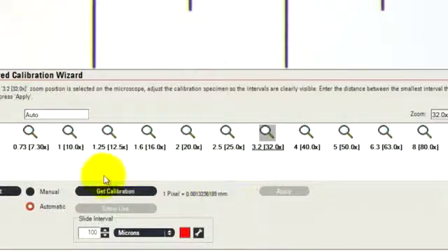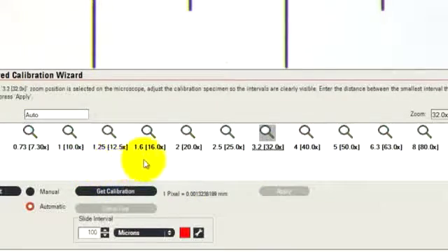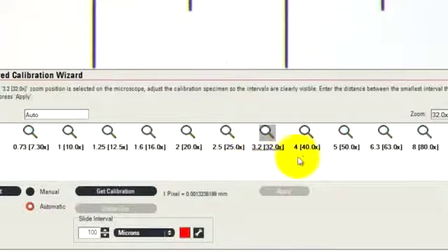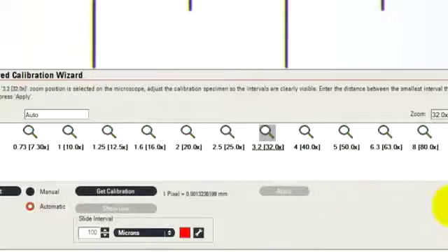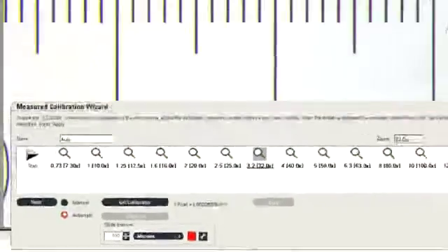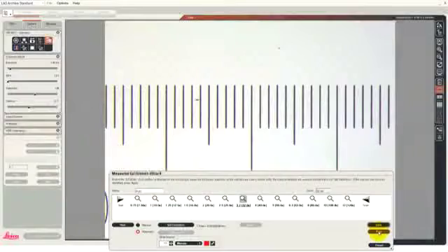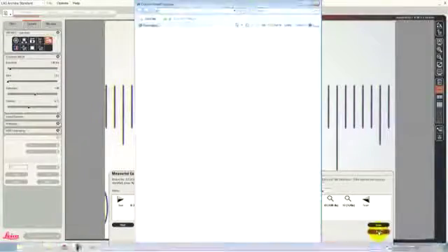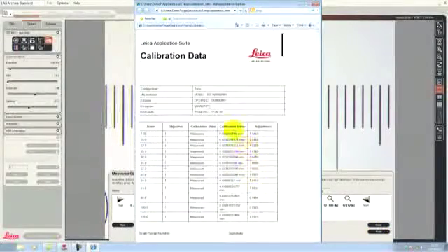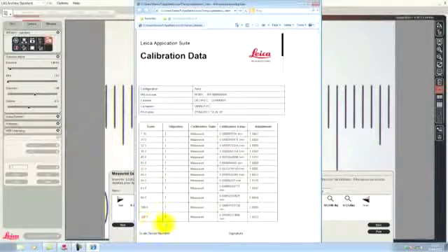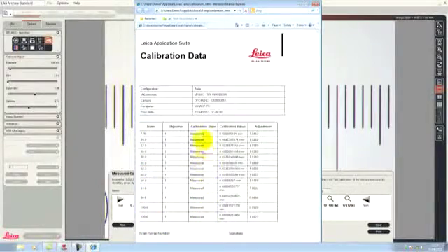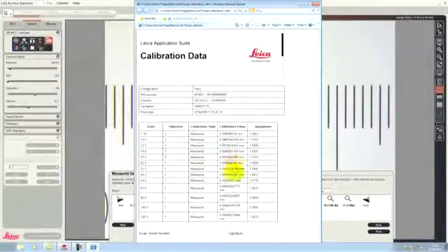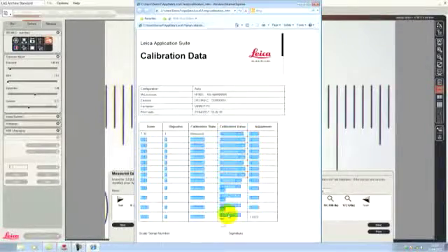In this particular case, I would normally want to repeat this calibration for all possible zoom positions. I've done this before. So we can now immediately look at the printout form that shows us all the measurements that have been made. And you can see here that for all the different zoom positions, I've measured the calibration, and the calibration value is shown in the column here.